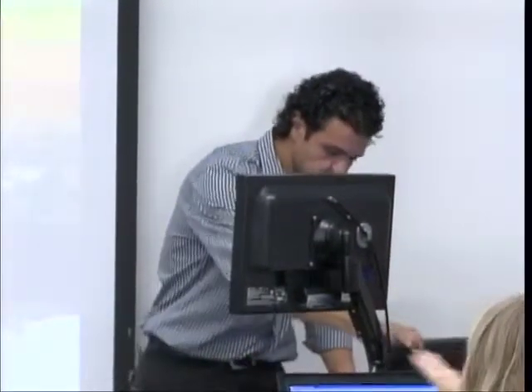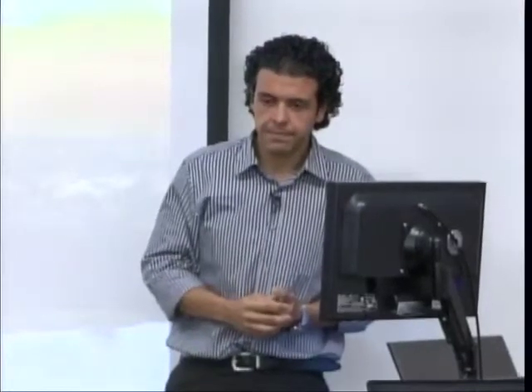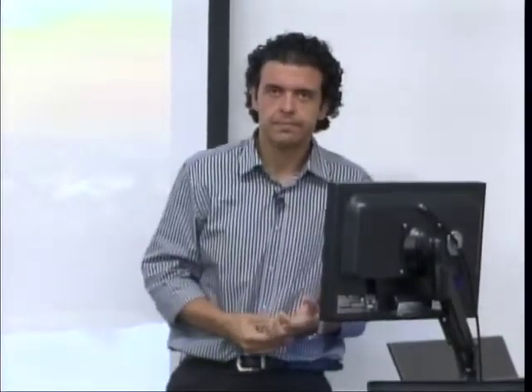Now, if you were doing this without us here, how long would it take you? Obviously this took way longer than normal. Because I know what the landmarks are, it takes me about 7 minutes with the measurements and the landmarks for a full run.